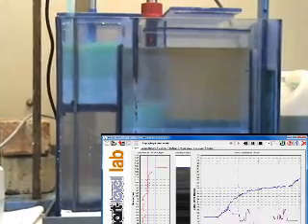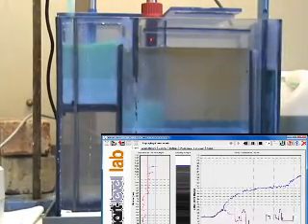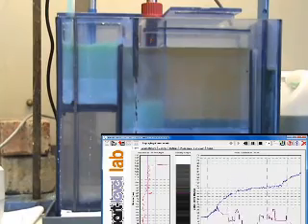Here you see the emulsion phase thickness starting to increase as the flow rate is increased.